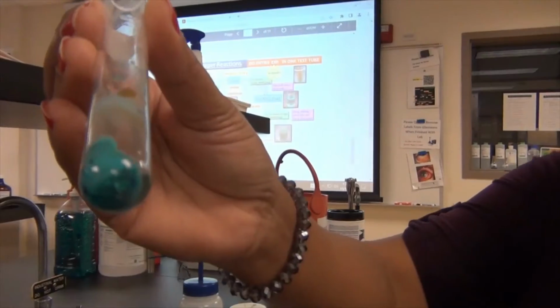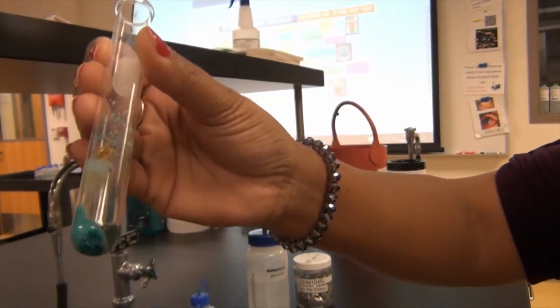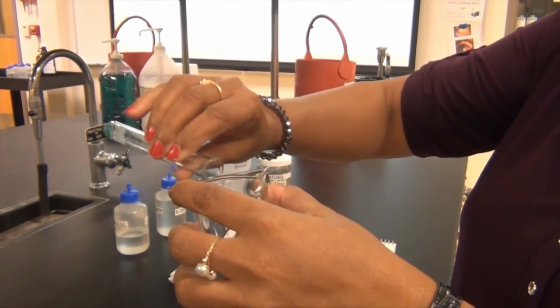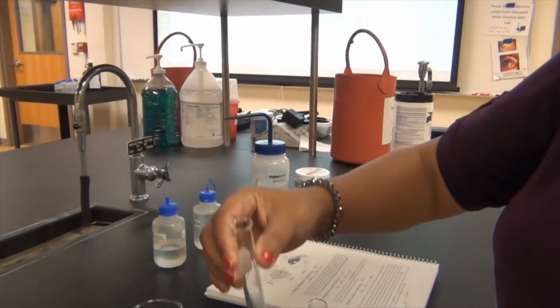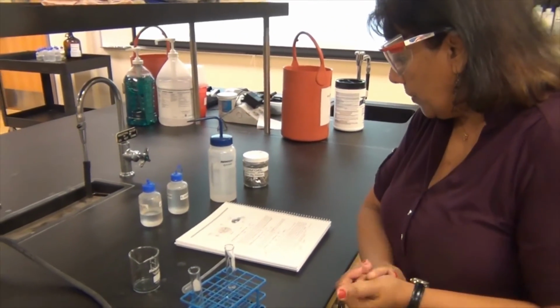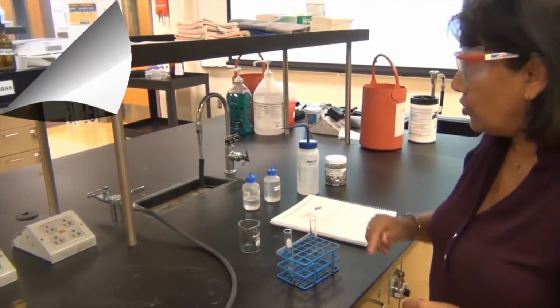So note the color, okay? See how much I have. And I know we didn't weigh out the copper, and I actually can't weigh out anything right now either, so it doesn't matter. But this is what we have, and this is the waste, okay? The waste is just the waste. There's nothing much happening there. So now this is going to be step C, where I'm going to go ahead and turn on the Bunsen burner and heat the test tube a little bit.